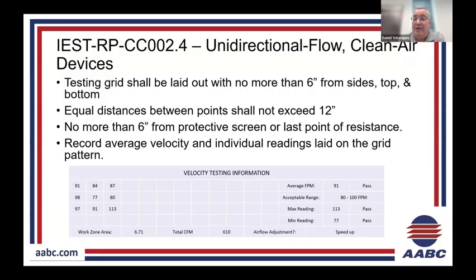One of the things they do test, and a lot of these laminar flow devices, you're going to test and calculate, is the uniformity. What is the uniformity compared to the average? Most of the vendors will use 25%. You want to have the air coming out in a nice equal grid. That's where the airflow pattern testing, like I mentioned earlier, can verify and demonstrate that the air is nice and laminar. One of the things they use the unidirectional flow for is for sweeping particles away.